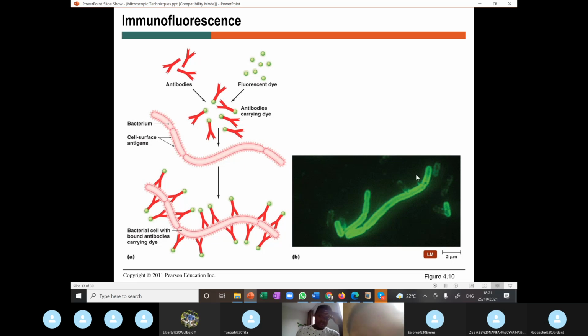These are still images of a fluorescent organism, but these ones are stained, indicating that we could use this to identify antibodies. This is a fluorescent dye that has been conjugated to an antibody so that we can observe the binding of the antibody to the antigen. So in this case, we have stained this object, and this fluorescent dye is what we are able to see after the reaction. But remember that the dye has been conjugated; it wasn't naturally fluorescent. This is the same image we're seeing here under the microscope, and you can see a very bright coloration across.